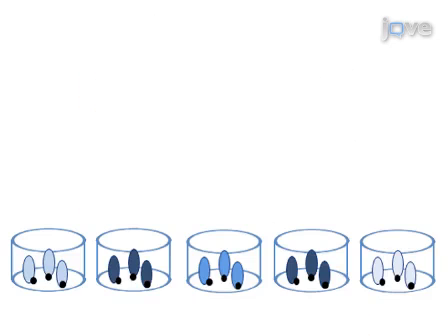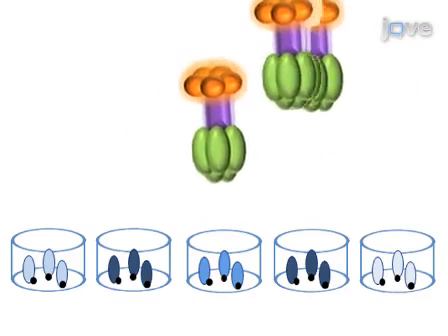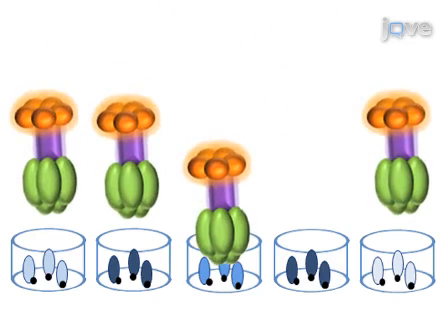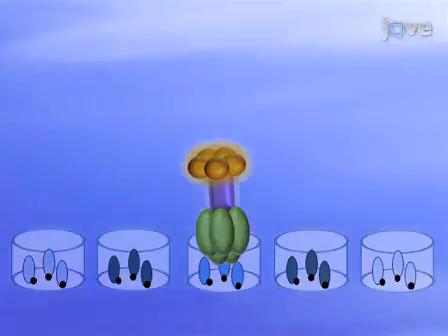Next comes the exciting part, screening for novel interactions. The baits are arrayed into individual wells of a microtiter plate and then probed for interactions using the prey. Then a wash step is performed.